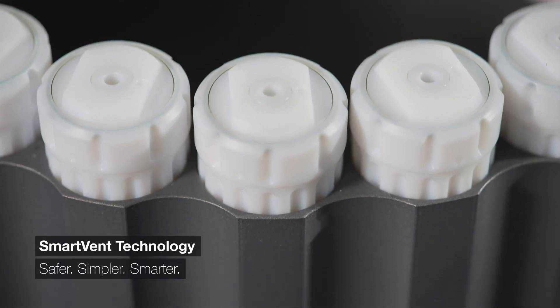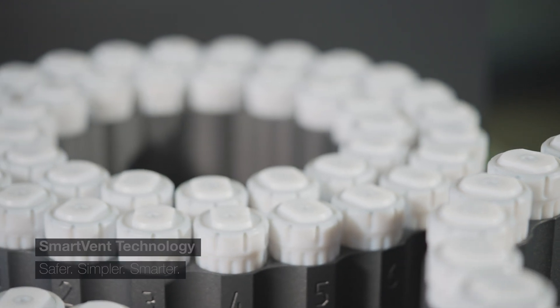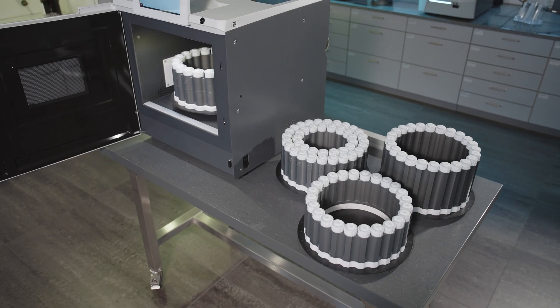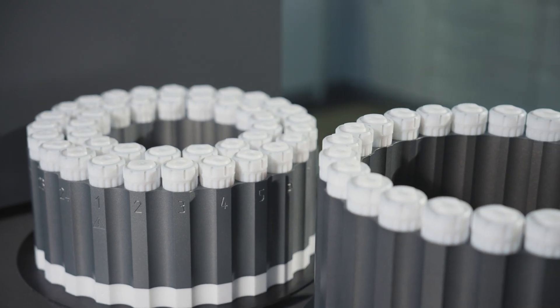SmartVent technology ensures safe and efficient digestion, managing overpressure during reactions. The SmartVent HVT and SVT rotors are robust, lightweight, and accommodate more samples on a smaller footprint.